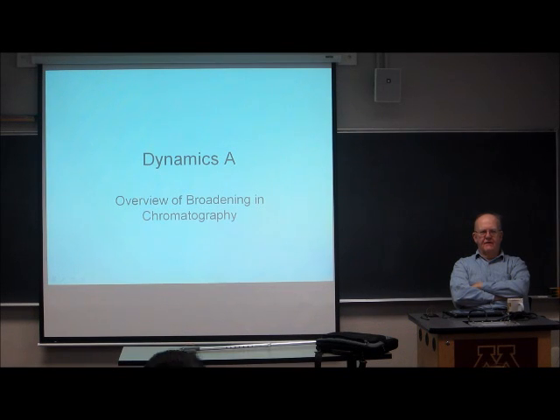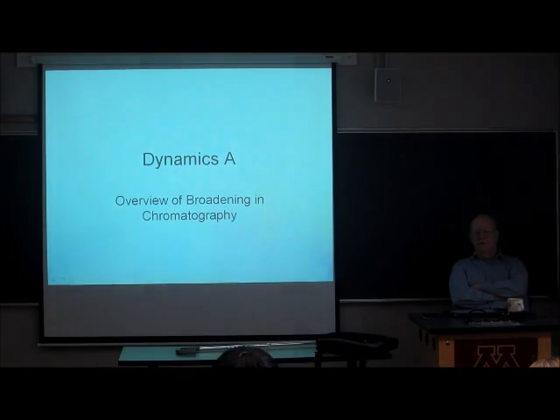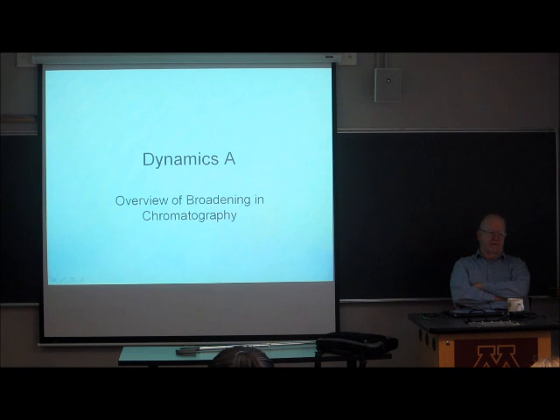About is the view of chromatography from outside the column, sort of a macroscopic view of chromatography. And today and for the next several weeks, we're going to be looking at a much more microscopic view of chromatography, and that is what's happening inside the column. This is not a molecular level view, it's more of a view at the stationary phase particle scale of things. But that's going to get us a long way towards understanding a lot of the processes that cause peak broadening.